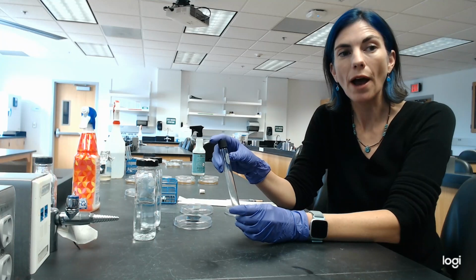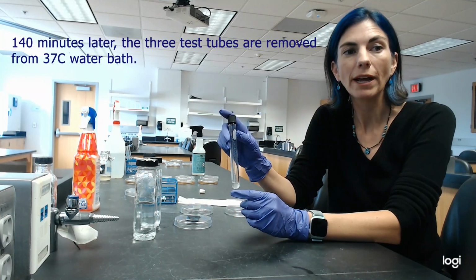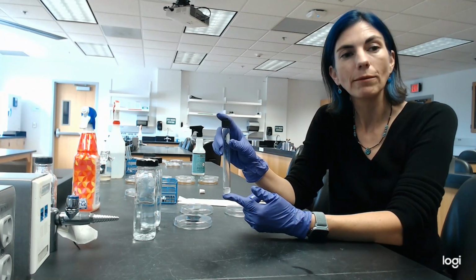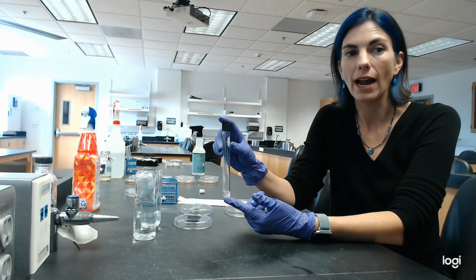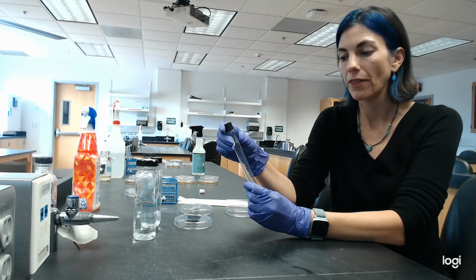Okay, so it's been 2 hours and 20 minutes since I put the test tubes in the incubator. So I went ahead and grabbed them out of the water bath. And now I'm going to do another set of serial dilutions 2 hours and 20 minutes later, for a total time of 140 minutes. So this one is the control. This is E. coli with the control.